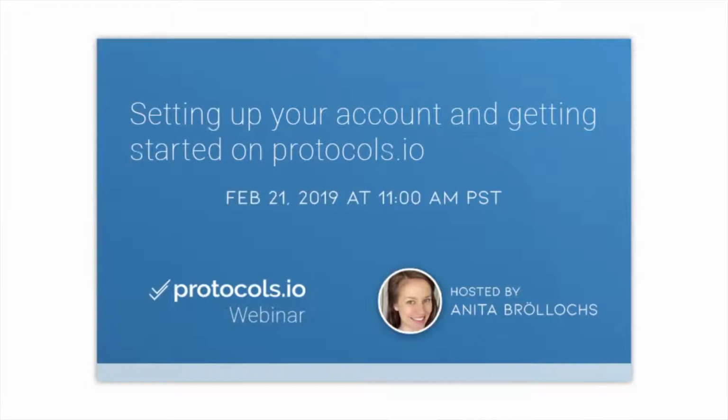We're going to talk about how to set up your account and getting started on Protocols.io. My name is Anita, and I'm the head of outreach here at Protocols.io, and I'm going to walk you through this webinar today.